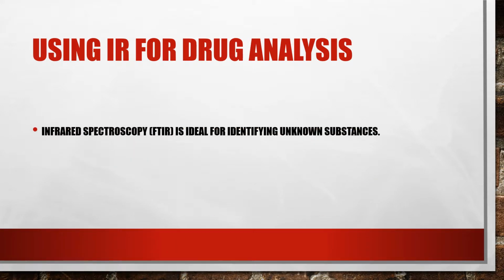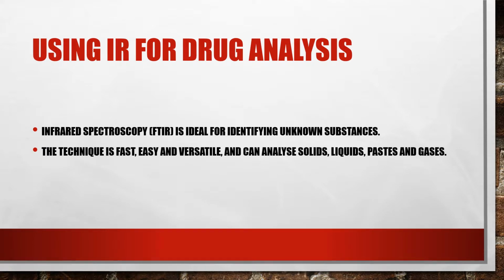Infrared spectroscopy, specifically FTIR, is ideal for identifying unknown substances. The technique is fast, easy and versatile, and can analyze solids, liquids, pastes and gases.